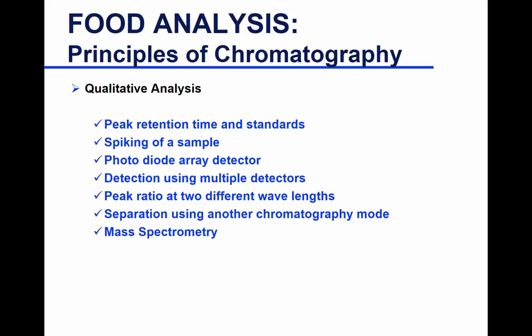But once you achieve a separation, then you want to see, am I after detection and trying to identify what I have in my sample? So that's qualitative analysis. Or am I after quantitative analysis? So qualitative, you look for, okay, like we did for the caffeine sample, we looked at retention time and we looked at comparison with the standard. Oftentimes this works. You look at the retention time of your standard and your retention time of the solute, they match, good to go. Sometimes it's not as easy.